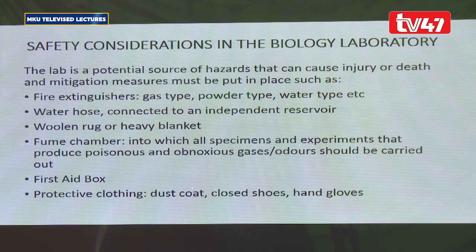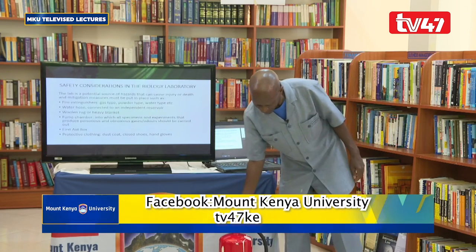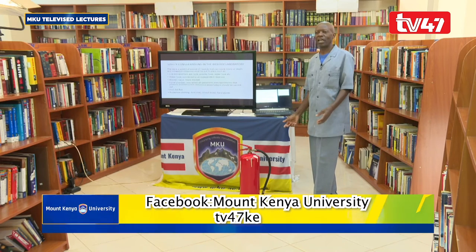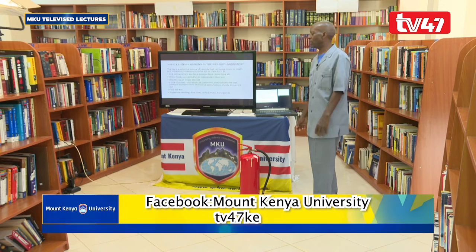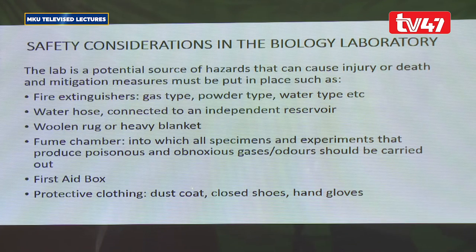For example, we need to have fire extinguishers. And remember, there are fire extinguishers of different types. We have the gas type, we have the water type, we have the powder type. And all these should be available in the biology lab to mitigate fires that may occur once in a while.